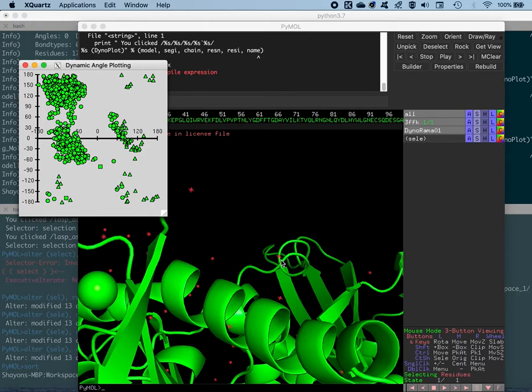So you might ask the question, why is it considered a loop region when you already know that the designated beta sheet region for the other amino acids is basically in this region? As you can see, this particular residue out here that we selected is slightly an outlier from the designated beta sheet region, which is highly populated around here. So the red region is around here, followed by the yellow region. So this lies somewhere around this region, slightly away from the designated beta sheet region, so occupying this loop region.